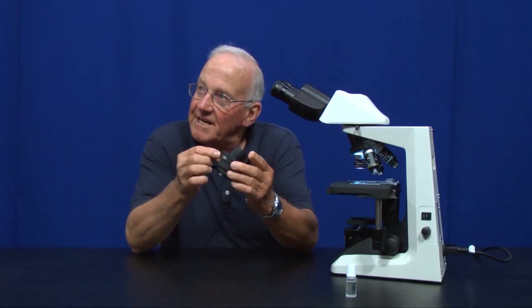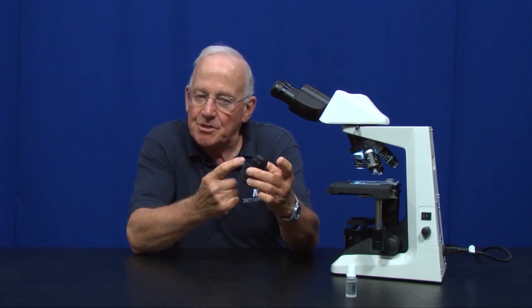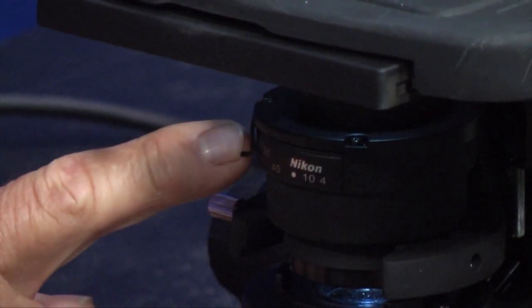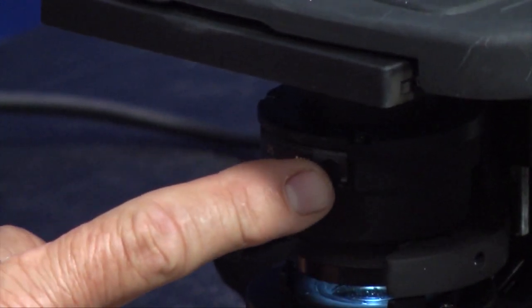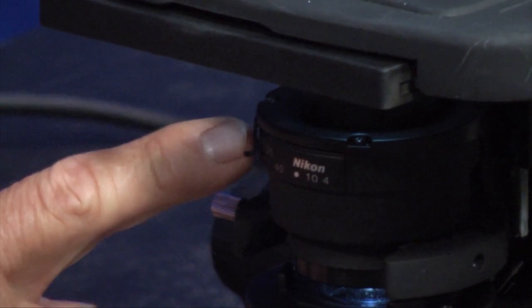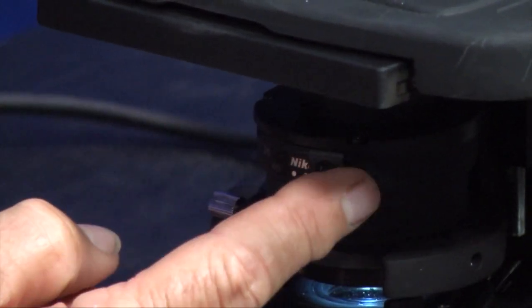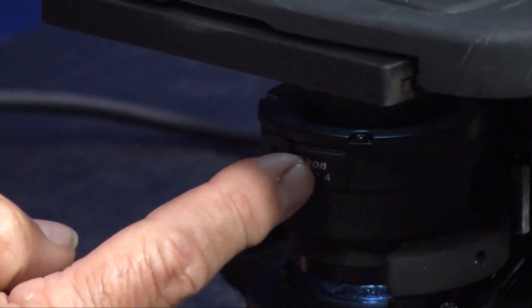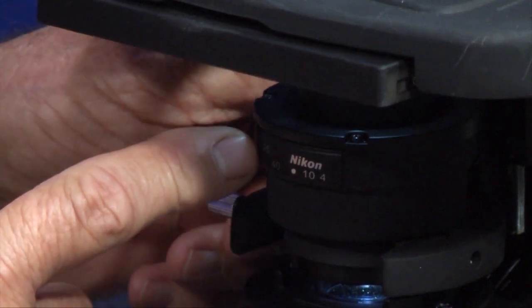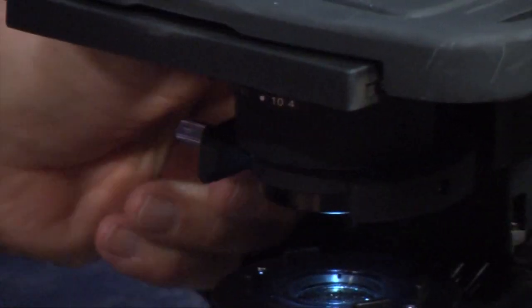It's important that when you first use the microscope, the aperture diaphragm be fully opened. When you turn this lever to the right, you can see it closing down. What you want to do when you start using the microscope is have it all the way to the left so that you're getting all of the light up to the specimen.